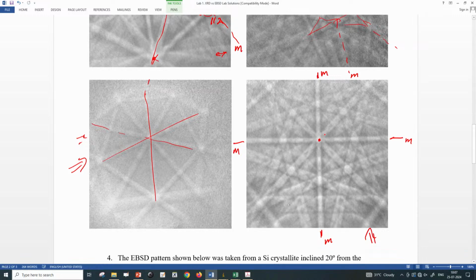This is a 100 type of a zone axis. And so if we look at 4-fold symmetry, we can look at a few things around here, but this zone axis and this zone axis, this zone axis, these all have to be the same as each other. This is trapezoidal instead of square, but that's because of our distortion in the gnomonic projection, right? Yes, good. Okay. So it's a good time for a quick break, I think.